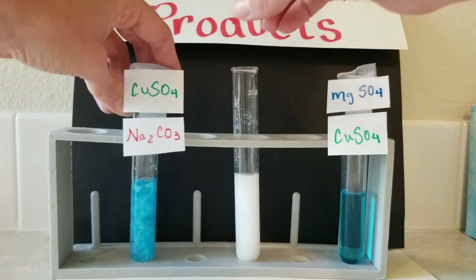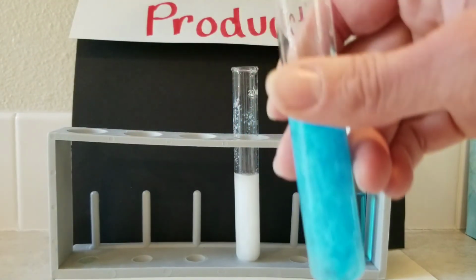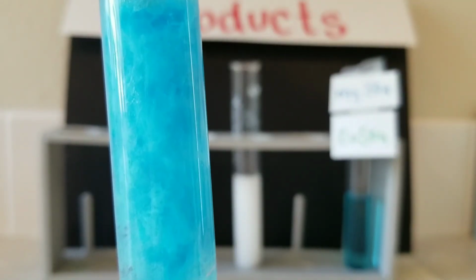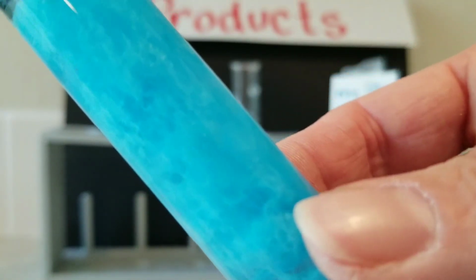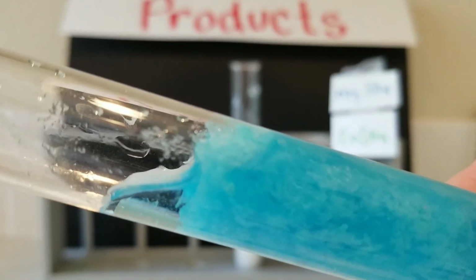And then our last one is the copper sulfate and the sodium carbonate. And this last one is a really pretty one. You can see where there's some areas that are just clear liquid and some that are still really cloudy instead. So when we're looking at this one, I'm gonna go ahead and turn it to the side a little bit so you guys can see.